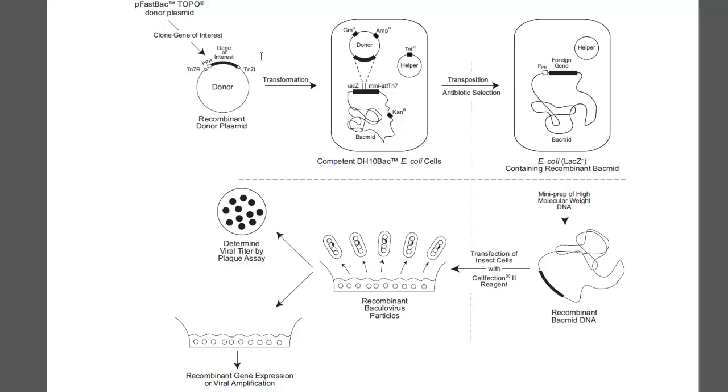Another important thing is the competency of your cells — whether you're making your own or using commercial cells. And the last thing is false white colonies: they look positive, but if you pick them and try to grow them up again, they won't grow. You have to be careful with that. At the colony-picking step, pick the whitest, largest, most robust-looking colony on the plate. Don't pick any that look small and very faint — trust me, it's not going to work.